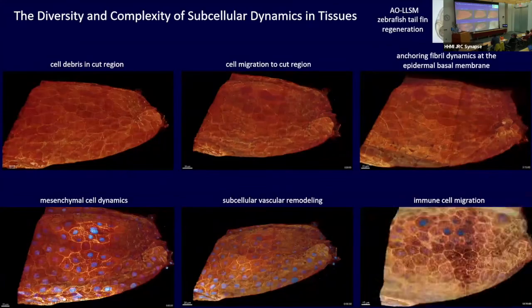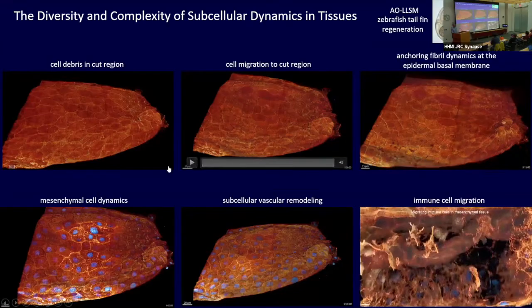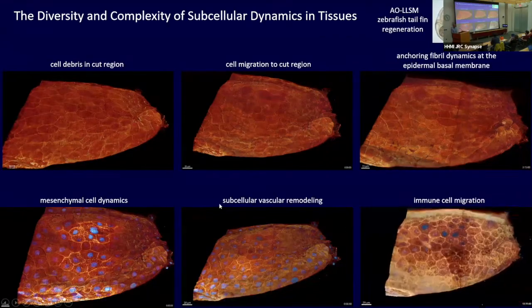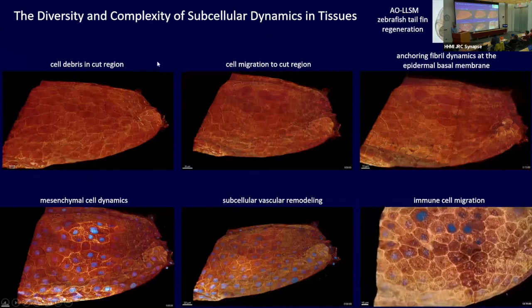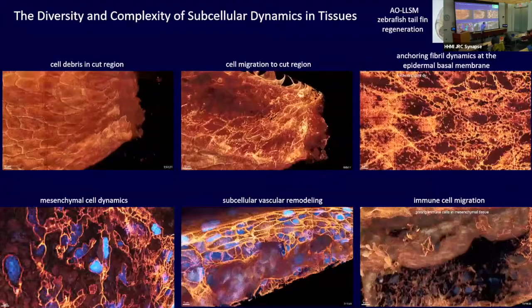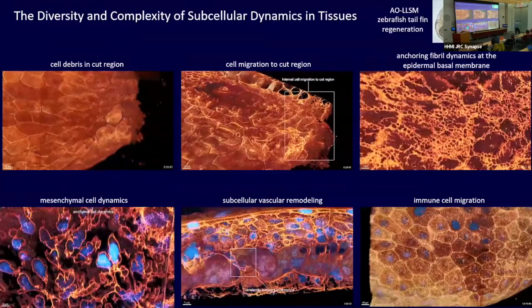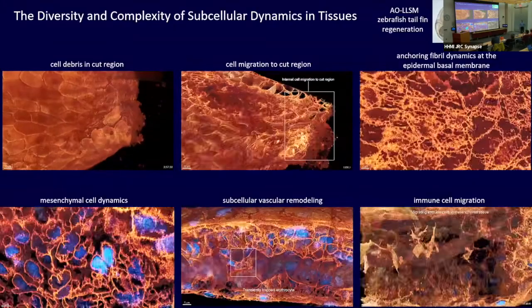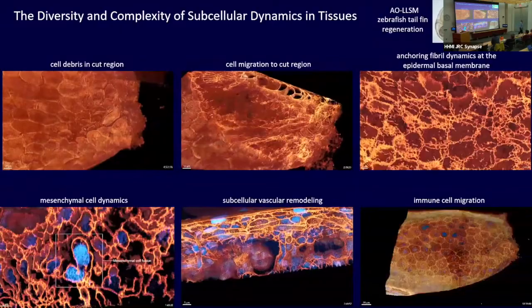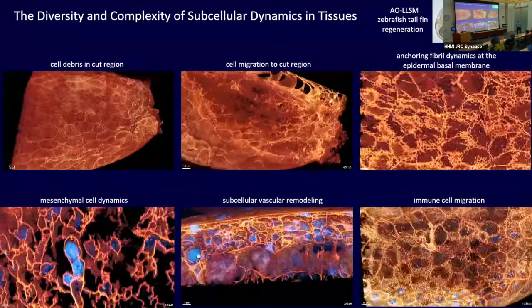So that's fine. Now we have the ability to take data at high rates. We have the ability to pre-process data at high rates. But what we don't have is the ability to then analyze the data at high rates. The challenge with multicellular imaging, and the promise of multicellular imaging, is that in biology there are, of course, many different cell types, many different behaviors. The advantage of the lattice AO is that we can see all of those.